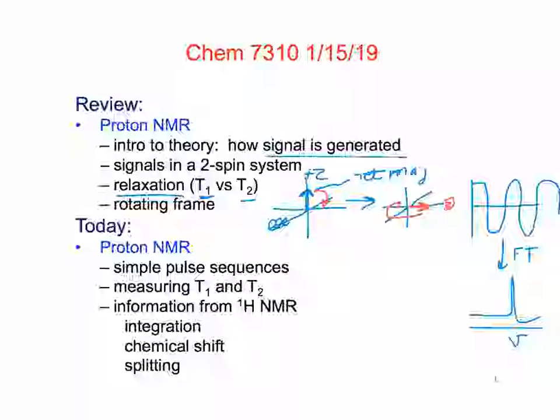The last thing we talked about is just another way to think of this coordinate system, called the rotating frame.